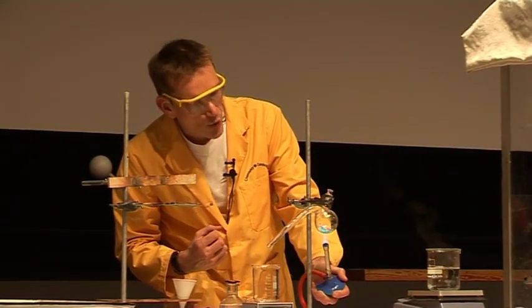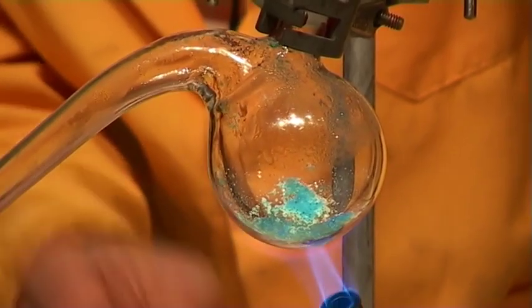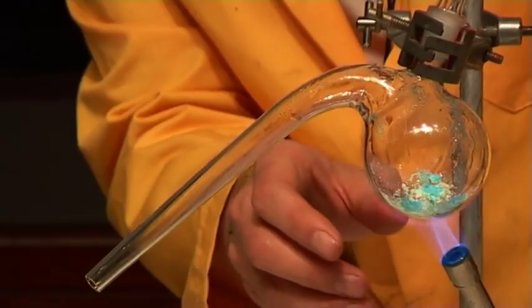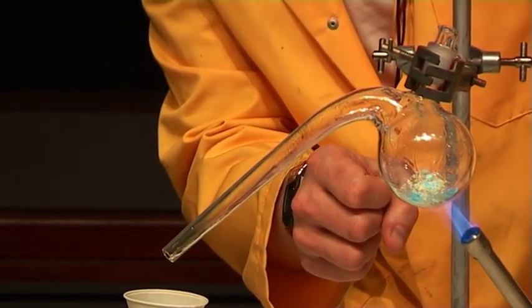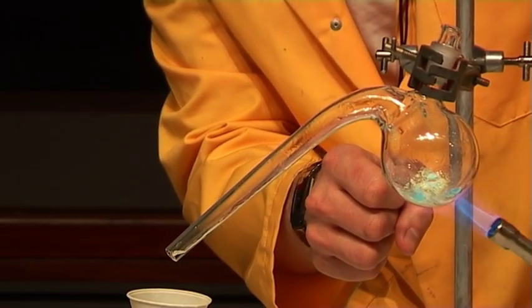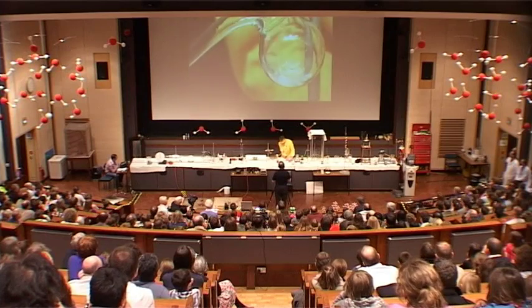So the crystals are blue because of the interaction of the water with the copper ions, but once the water is removed, and we can see some of the water condensing in the neck of the retort here, well, the crystals are actually changing to a white colour. So you should be able to see some water dropping out. It's just about to drip out the bottom. There we are. I think we're just about to get a drop. There are some drops of water. So as I say, it's the water contained in these crystals interacting with the copper ions that gives rise to the blue colour.